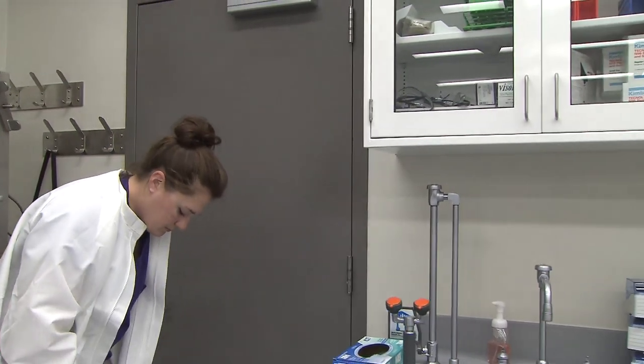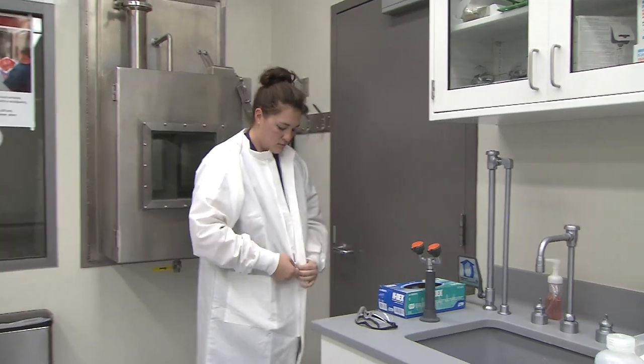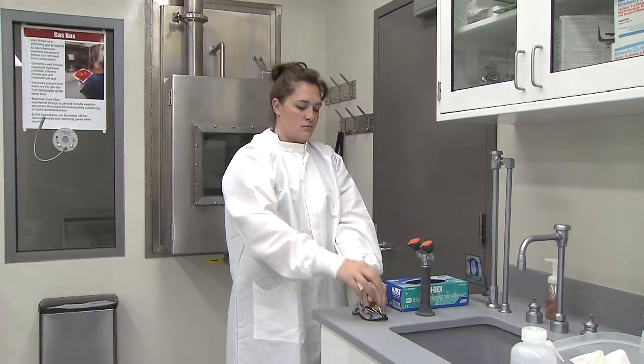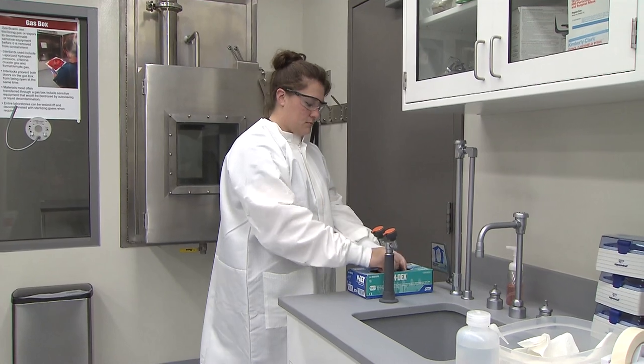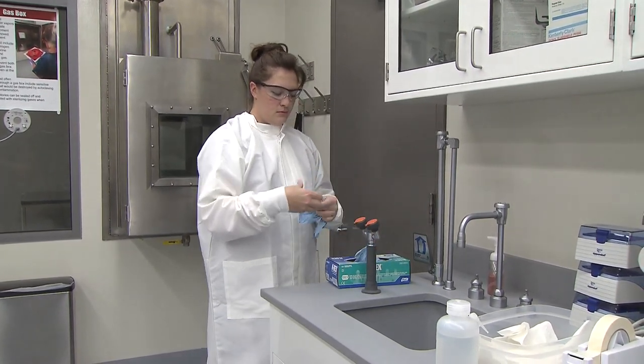Safety glasses or other form of eye protection, and you may wear a respirator depending on the project you're working on and what exactly you're doing, and then you would wear a disposable lab coat or gown.